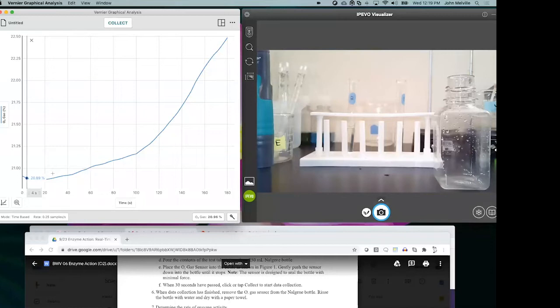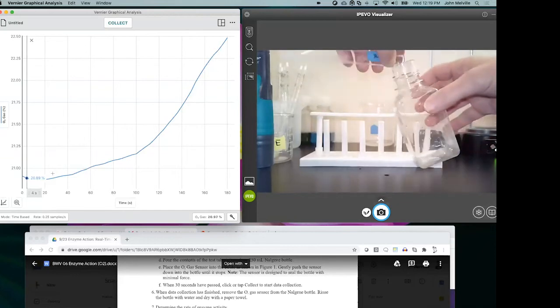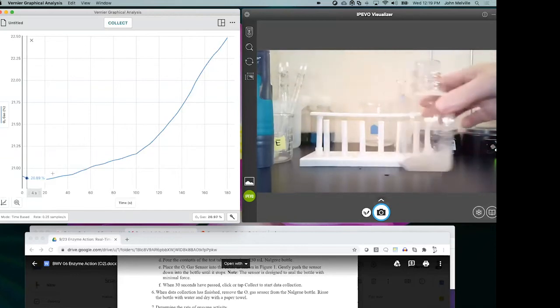So what I'm going to do next is put in 10 drops. Swish it around a little bit.